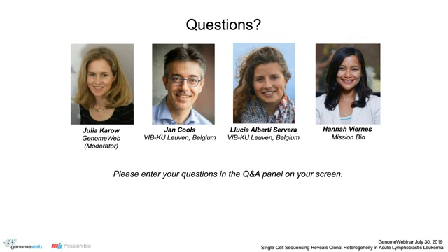And then finally, another quick technical question. How do you discriminate between variants that are due to amplification or sequencing errors? Right. So if a variant is due to, for example, a sequencing error, this will be already discarded during one of the first filterings, so that we set the threshold that at least 20% of the reads need to be of the variant. So if one or two reads have a variant, it is not sufficient to be annotated as a variant. So it could be a sequencing error.